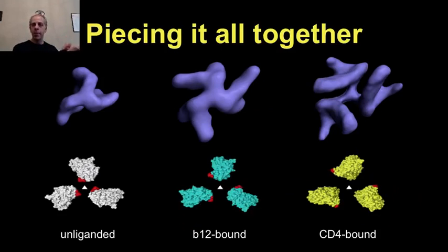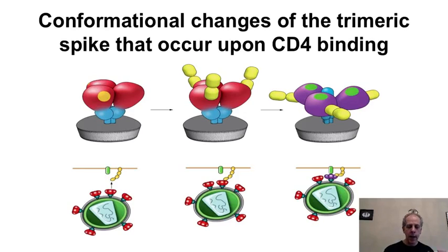And this is what the people from biology teach us. That is the important part. Why are we doing this? They come and explain. Because now I can look at the HIV envelope under different states and see that their shapes are different under different states. And then you can start making biological conclusions about that and say, under certain conformation, this is what happened; under a different state, when it's actually latching into the CD4, it's changing shape. And that's extremely important for the vaccine development people.